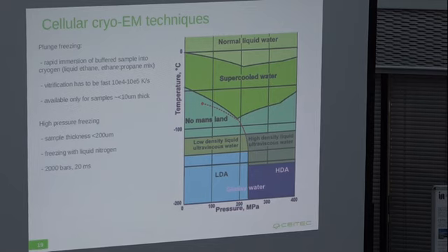Since the room temperature techniques we talked about before cannot bring the utilization of the electron microscopy into the region of resolutions where you would like to be in order to prepare high resolution studies, an alternative approach is to quickly freeze your sample. And we have two general approaches for freezing the sample.